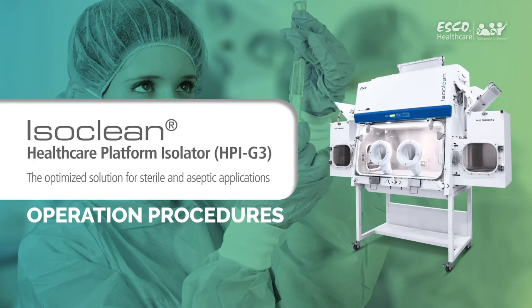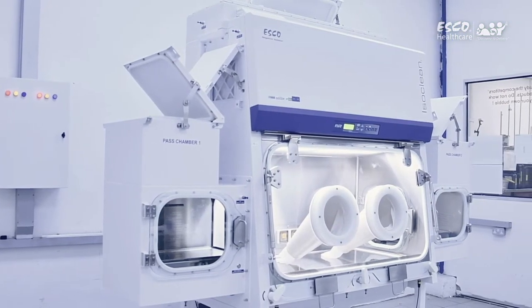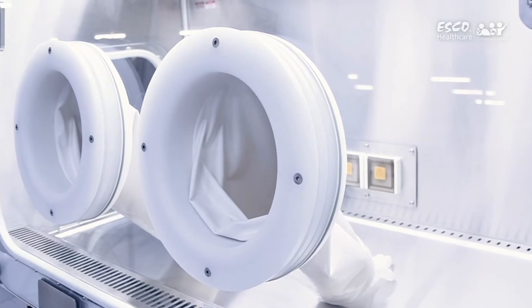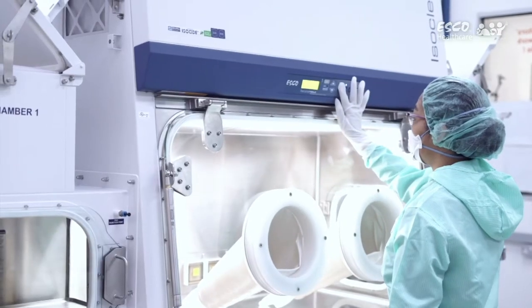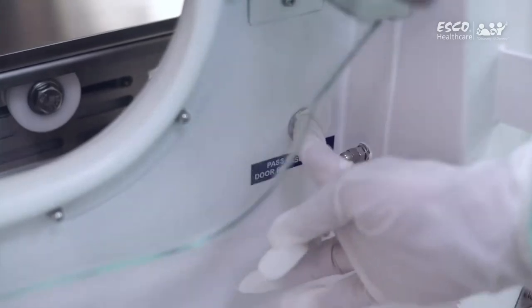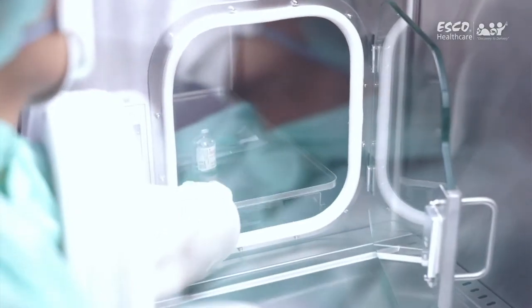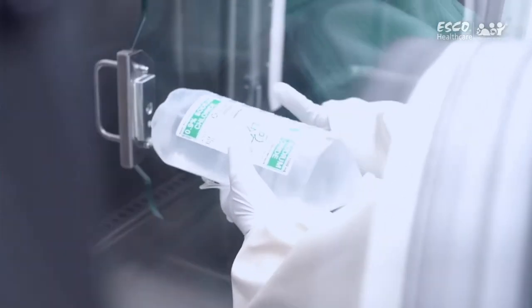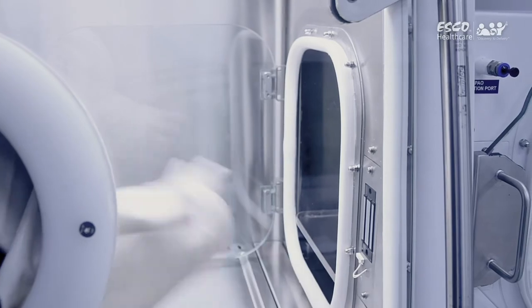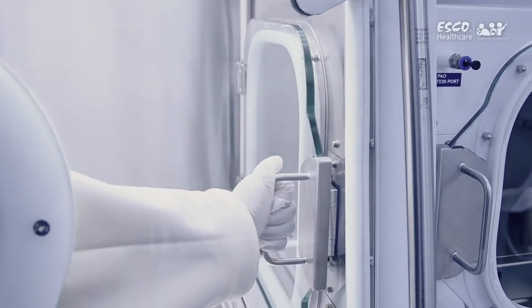The IsoClean Healthcare Platform Isolator is the optimized solution for sterile and aseptic applications. This is a short demonstration on how to properly use the IsoClean Healthcare Platform Isolator. This video also provides additional information on the recommended work practices to help users achieve the best performance and protection from the HPI unit.